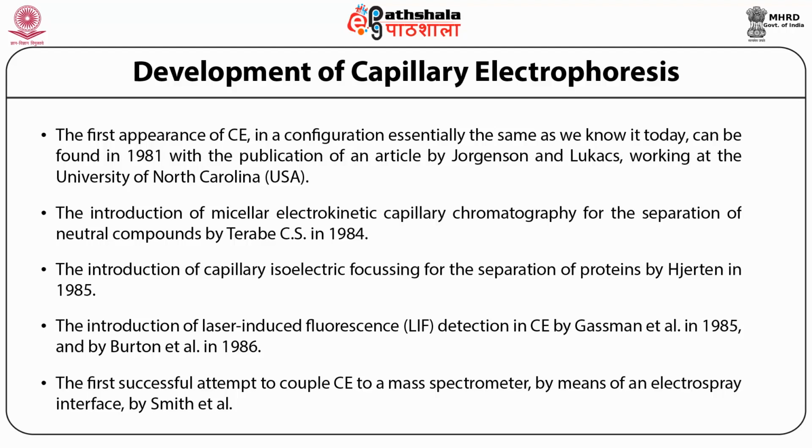An alternative to the slab format is to perform the electrophoretic separation in a narrow bore tube or capillary. Since narrow capillaries are themselves anti-convective, gel media are not essential to perform that function. This allows the performance of free solution or open tube electrophoresis as well as the use of traditional gel media in capillaries.